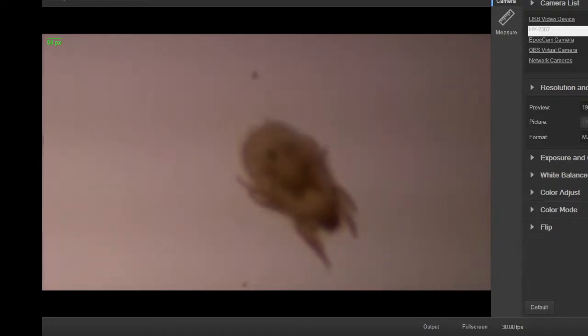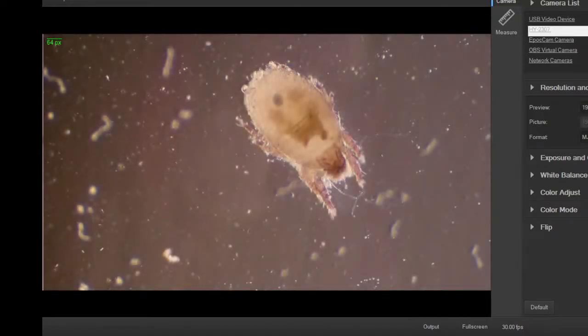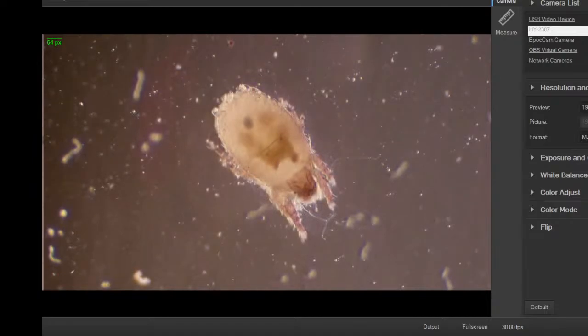Got it. Very cool. Let's fix the focus on that. Feel on the mite. Nice. So I'm able to look through it and still get some structure and some color. It's definitely not a tick.